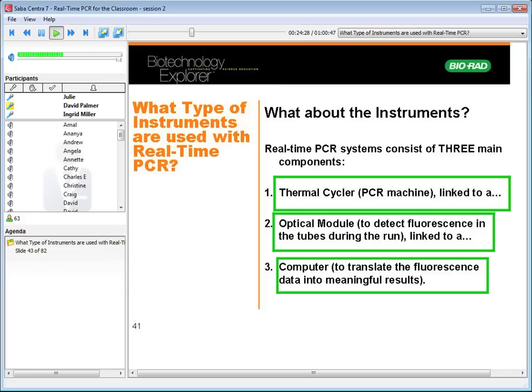And then the software will also show you what the data looks like as it comes in and then after it's finally collected. So typical data that would come out would be actual traces showing the real-time PCR amplification. If you have standards, you'd get a standard curve. You have a picture of your plate layout, and then a table of numbers that would represent the CT values, that left-right position of the curves.